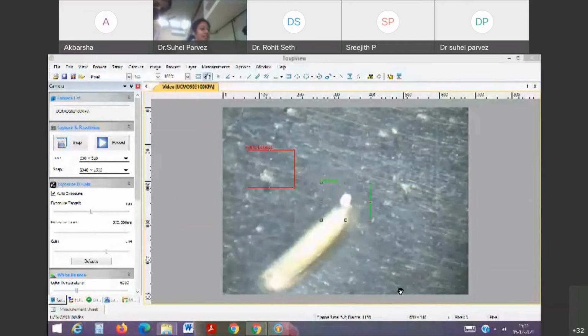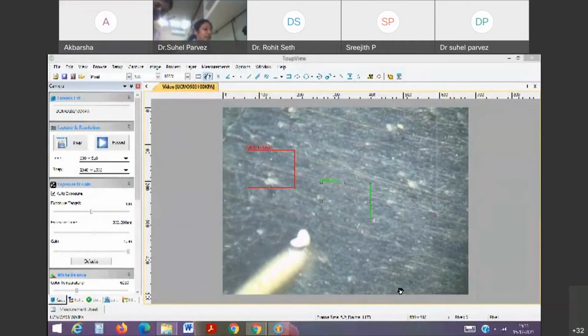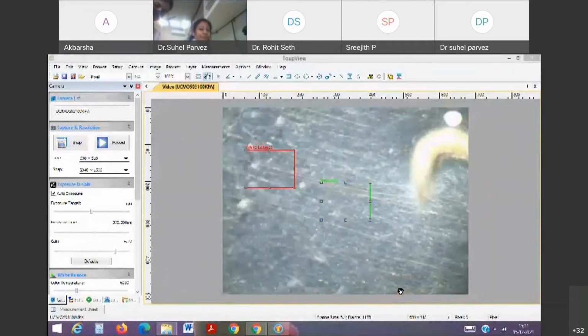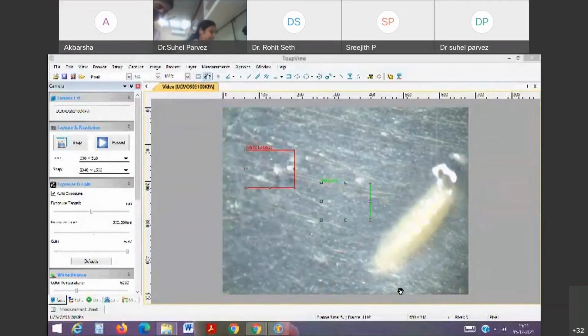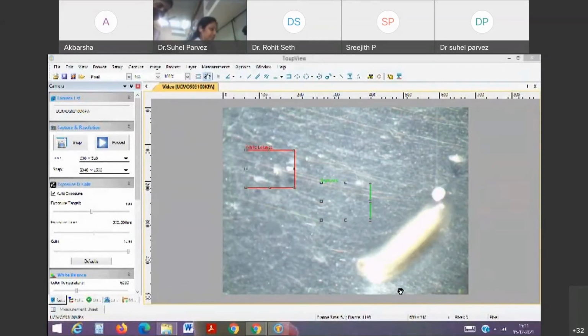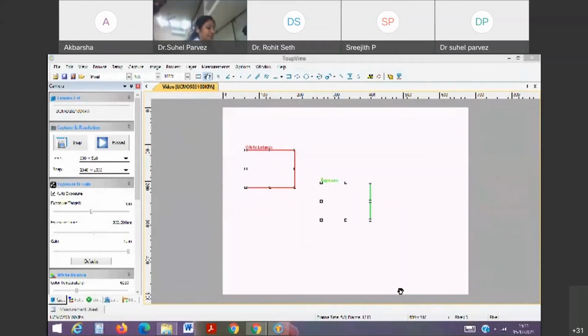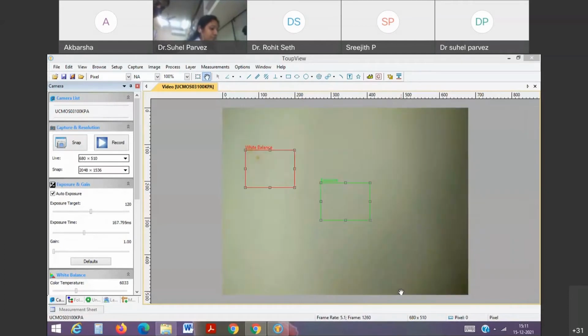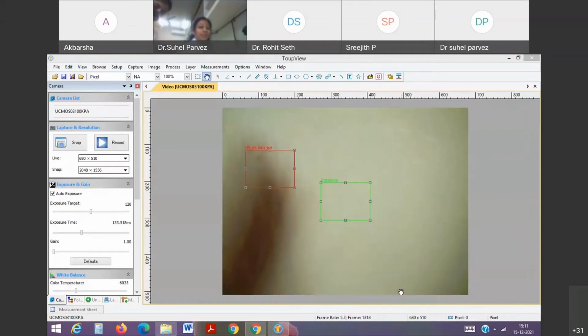This is the third instar larval stage. It's actually a very active stage, so it is just moving here and there. This is how the larva looks like. In the presentation, I'm just telling you about the phenotype of the wing.